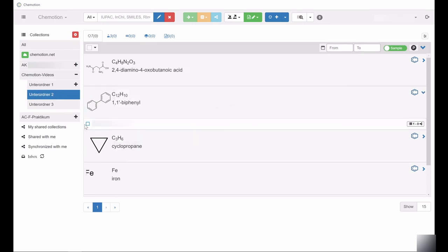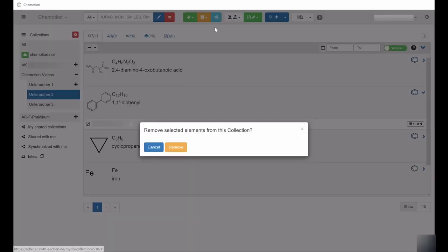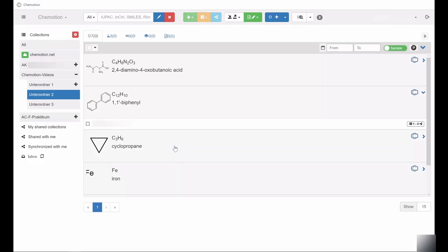Therefore, if you have deleted content from a specific collection, you can always reassign it via the All collection. In other words, you can recover deleted content.